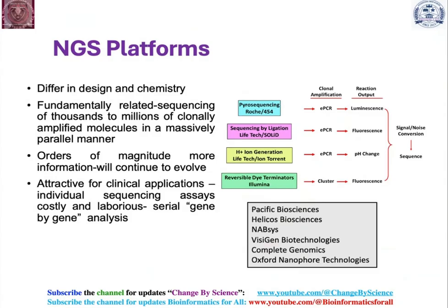Attractive for clinical applications, individual or personalized sequencing assays are possible, instead of costly and laborious serial gene-by-gene analysis. So there are a number of companies these days which are offering these NGS services at large scale, to researchers in academia as well as in industry.